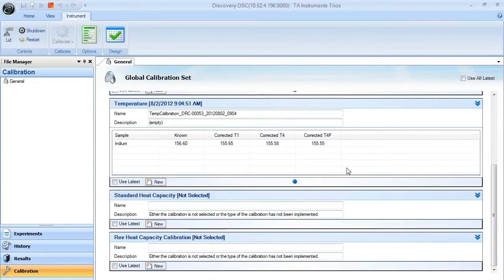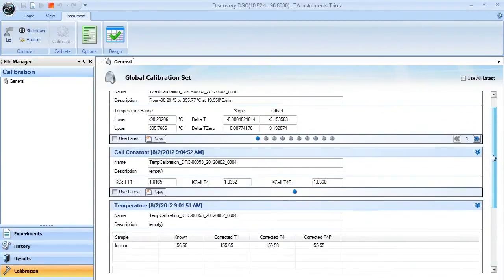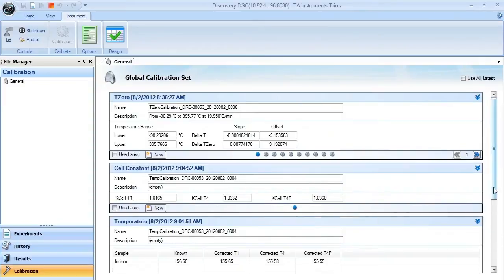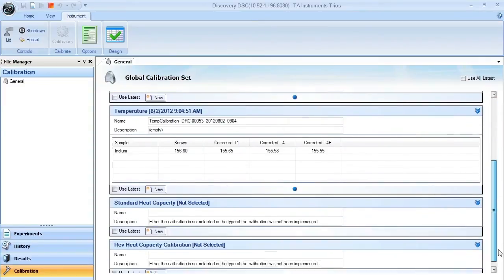You do need to make sure that you have your T0 calibration, cell constant, and temperature calibrations already completed before you can run your reversing heat capacity calibration.